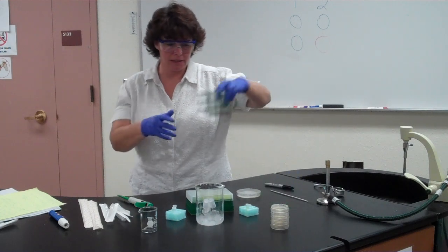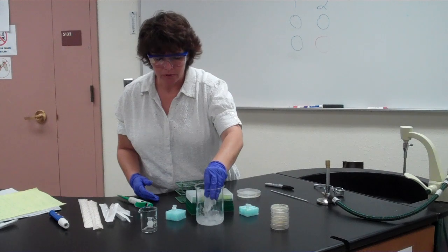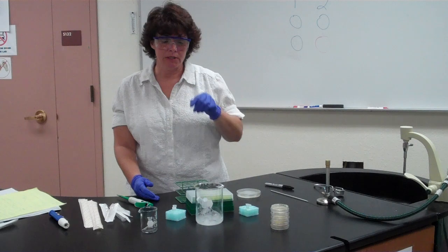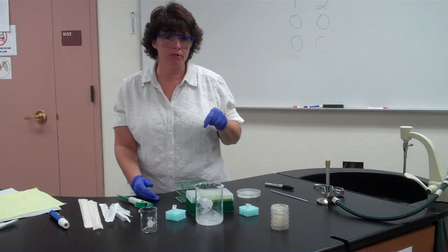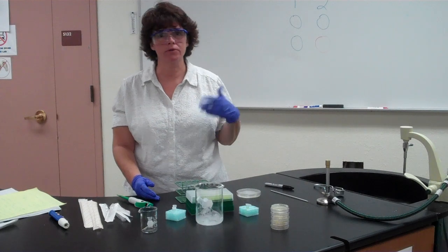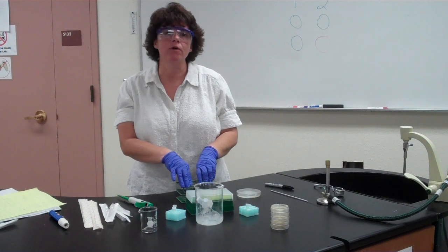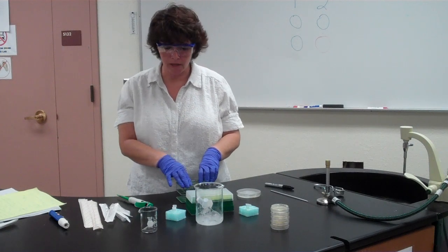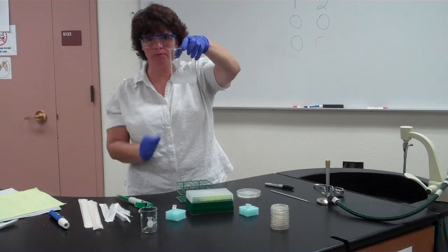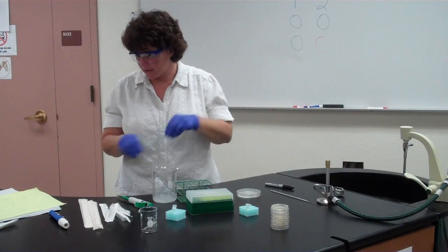There will be a rack in the water bath. When you label your tubes DNA positive and DNA negative, make sure you also put something on top — a symbol or initials — to designate your group's tubes, because everyone will have their tubes in the water bath at the same time. Bring your beaker of ice with the tubes in it over to the water bath, since you'll be going from ice to water bath and back to ice.